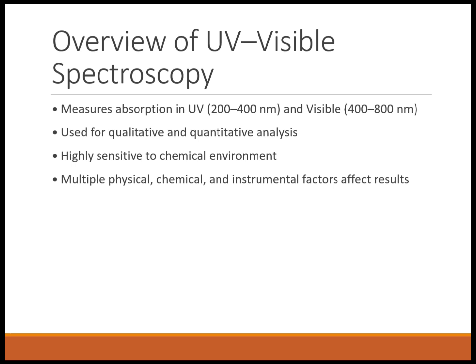However, because this technique is extremely sensitive, even small changes in the environment or sample conditions can significantly alter the results. Therefore, understanding the influencing factors is essential for correct interpretation.